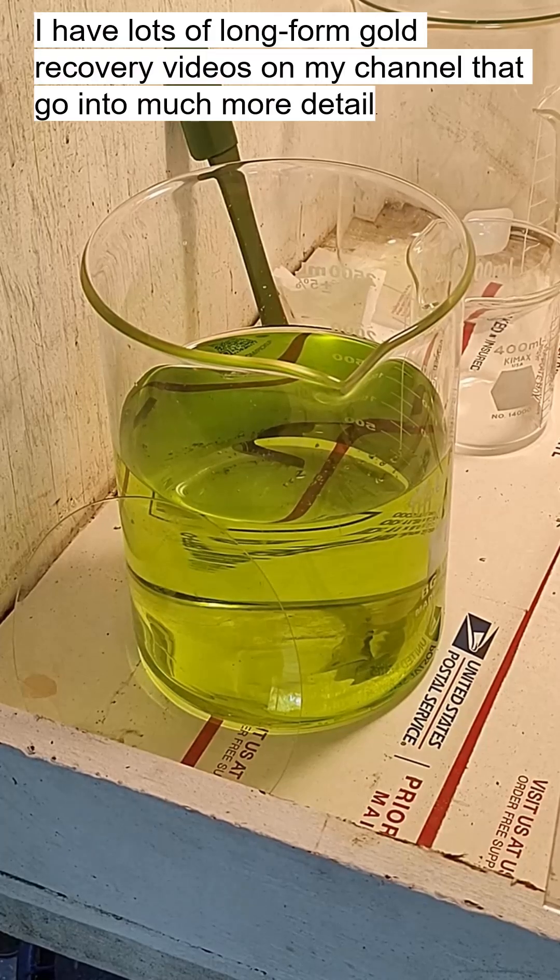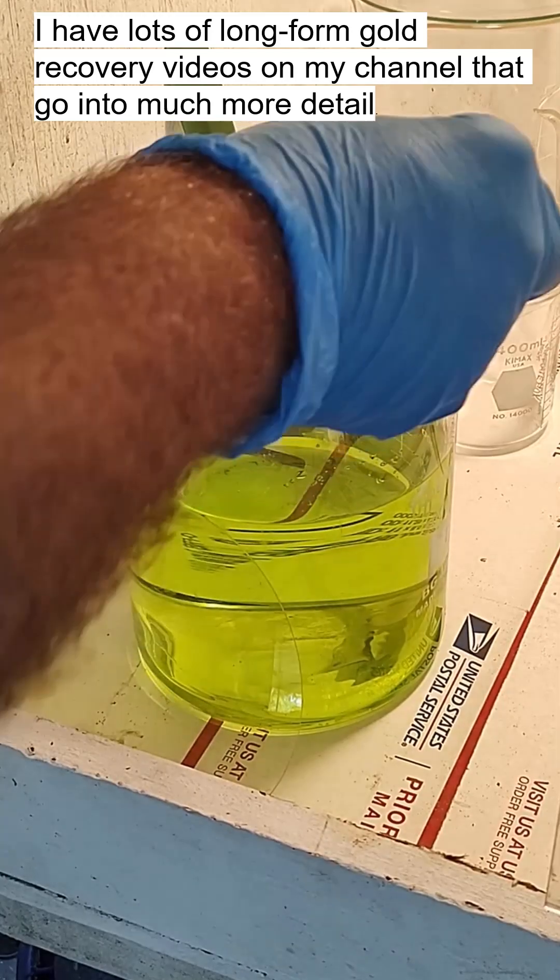Got a nice clean double-filtered gold solution here in the fume hood. Let's drop the gold with some sodium metabisulfite.